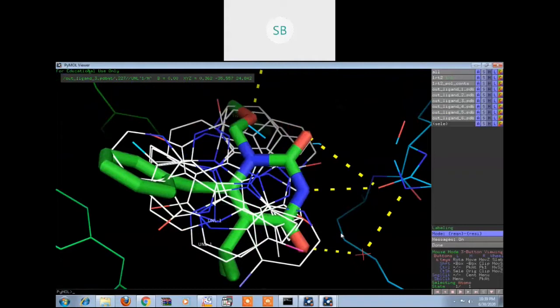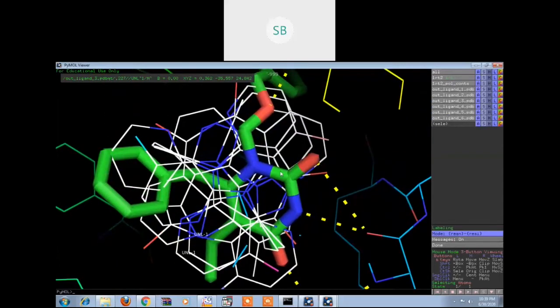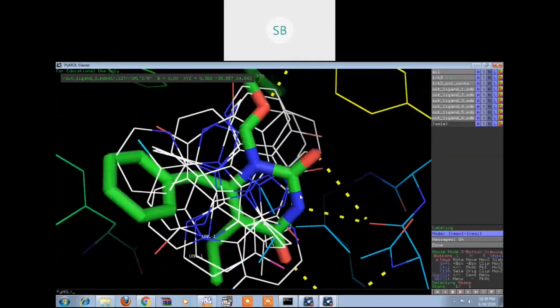But as we have taken the standard one like nevirapine, definitely the nevirapine is also occupying the place which is for this TNK999. So it's a successful operation, it seems. Likewise, just get the features, and you can see now it is something like this.